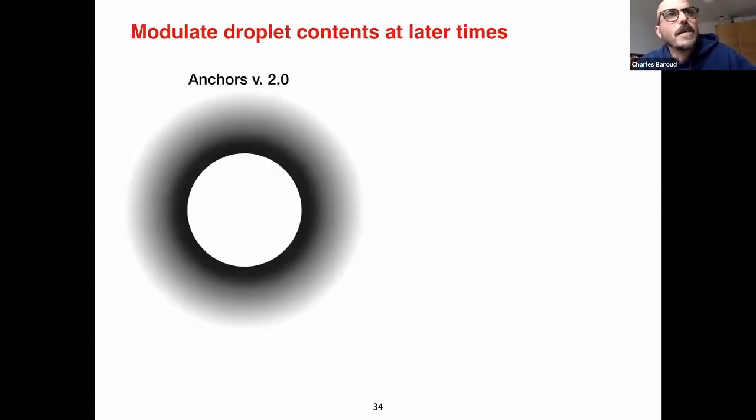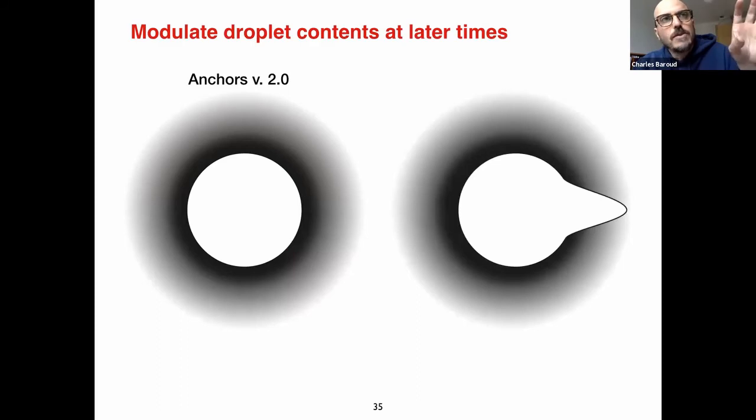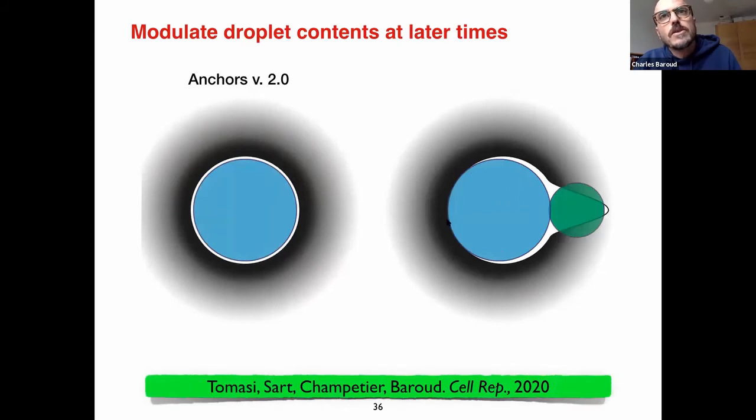So here we go for the immune challenge. Now what we want to do is we want to understand the interaction between immune cells and cancer cells. And this is the future of immunotherapy. This is the future of how we're going to treat cancers. So what we're going to do is we're going to make a large droplet that contains a cancer spheroid and a small droplet that contains immune cells.